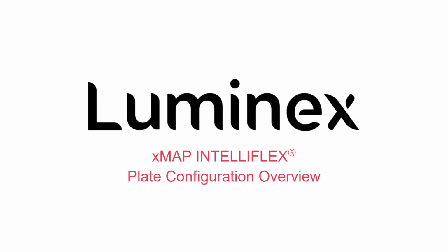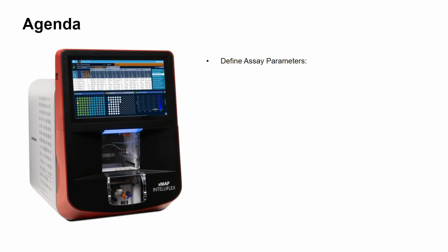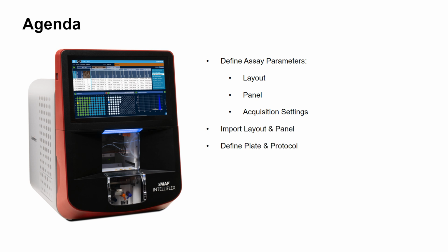Welcome to the xMAP INTELLIFLEX Plate Configuration Overview. The xMAP INTELLIFLEX software has multiple workflows to quickly and easily set up an assay plate. This overview will provide information on defining assay parameters including the layout, panel, and acquisition settings, importing a layout and panel, defining a plate and protocol, and finally, recommendations for xPONENT users.